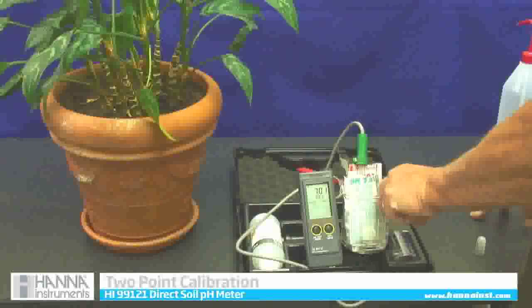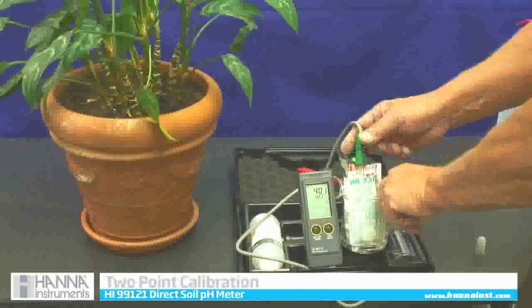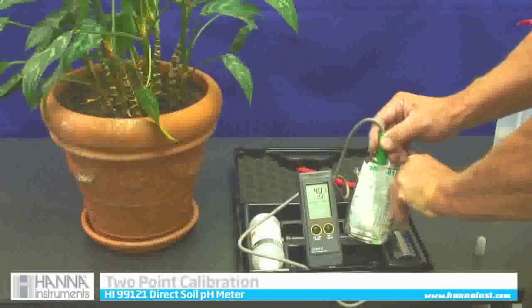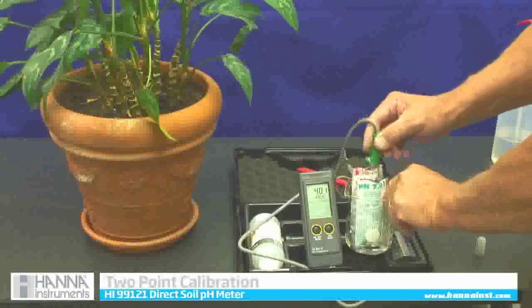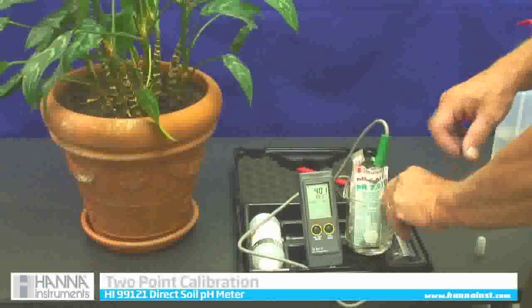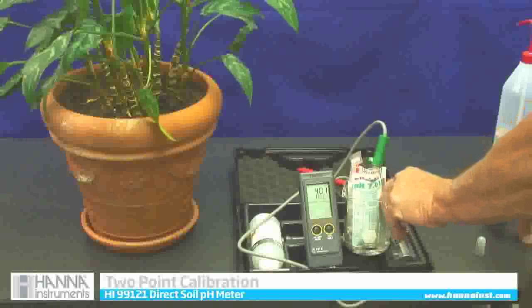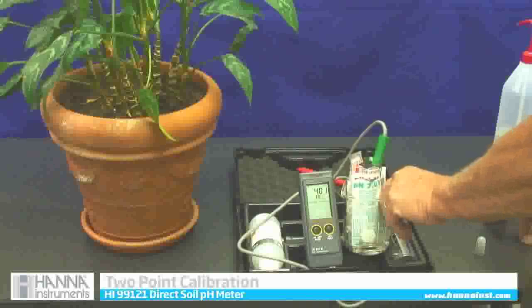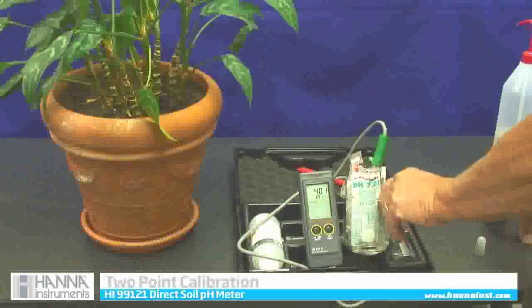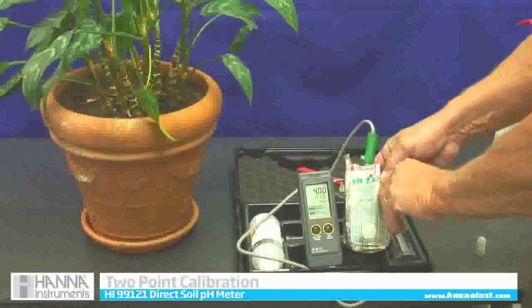It might take 30 seconds or so. While the meter stays in calibration, I am going to rinse it off with a little bit of tap water. Then it is going to say use 4.01. Now I am going to put it in 4.01 — I could also use a 10.01 if I wanted to, but in agriculture we use the 7.01 and 4.01 two-point calibration. It makes it very accurate. Now it says okay, two points — calibration is complete.